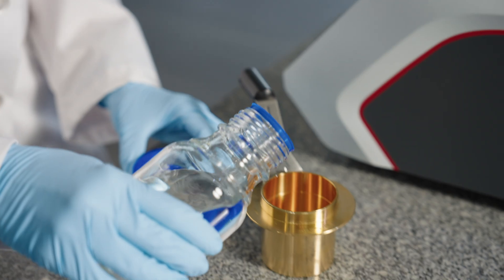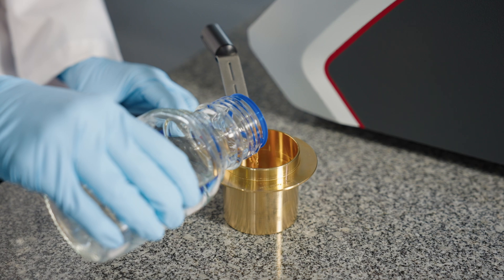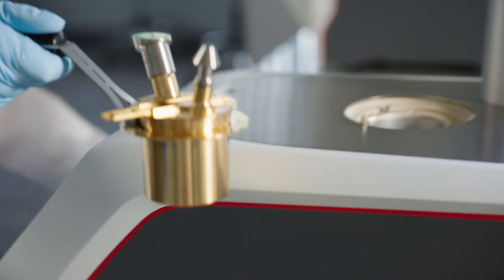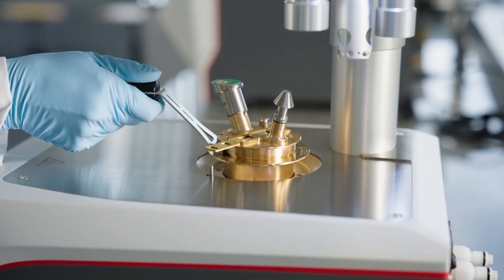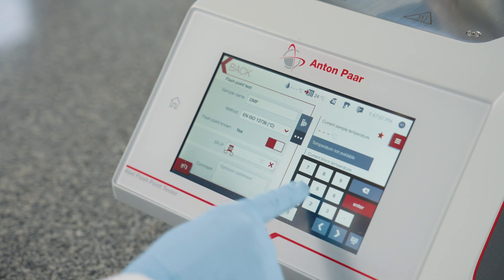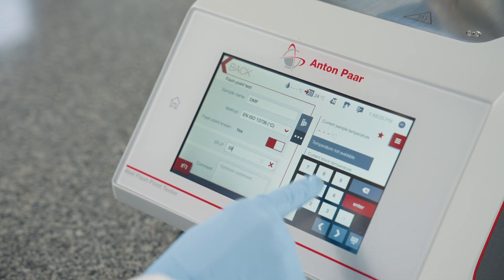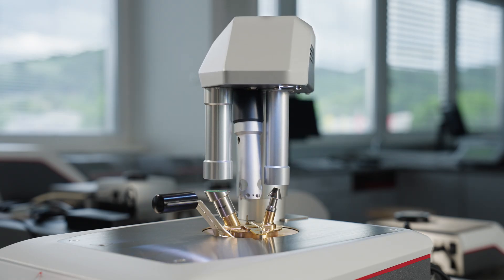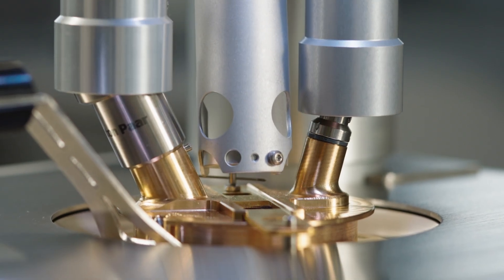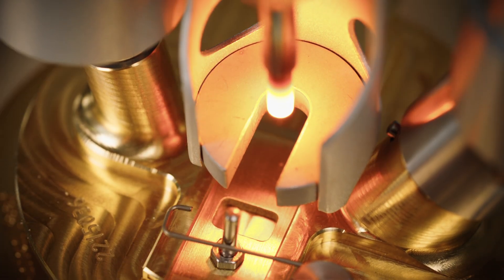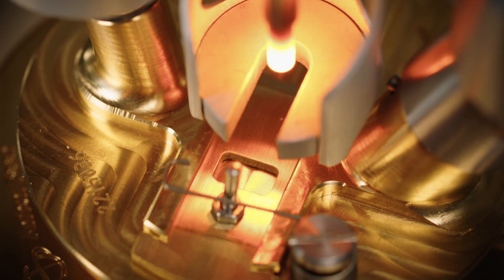In this example, using an Able closed cup flashpoint tester, we will measure the flashpoint of DMF, which is a commonly used solvent for electrolytes. Fill up the sample cup with the DMF solution, insert the cup in the instrument, type in the sample name and select the standard method to use, type in the expected flashpoint, which is 58 degrees C in this case, and start the measurement. The measuring head will be lowered and the measurement will start. The igniter will dip into the sample cup at intervals given by the standard used, trying to ignite the gas phase above the sample. When the flashpoint is determined, it will be displayed on the touchscreen of the instrument.